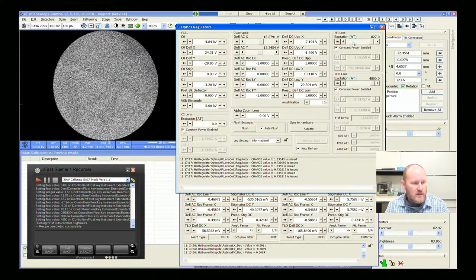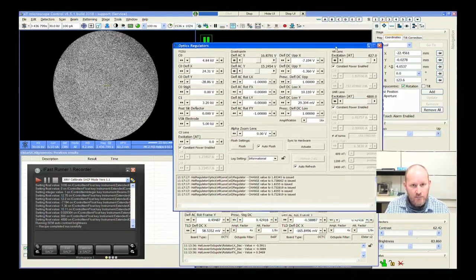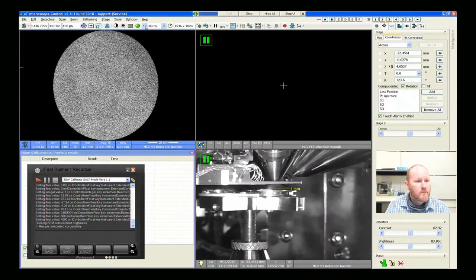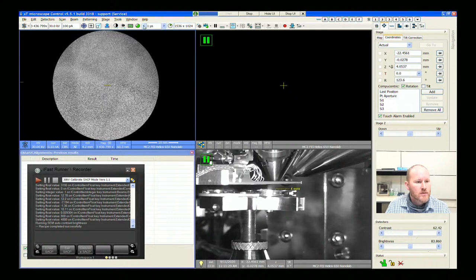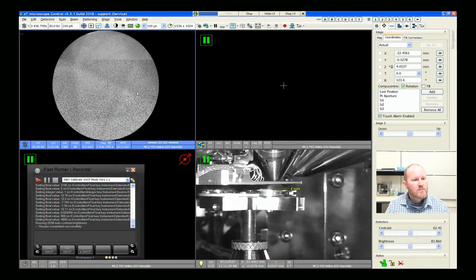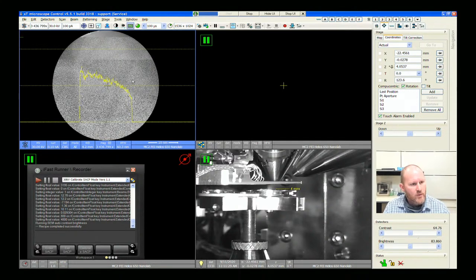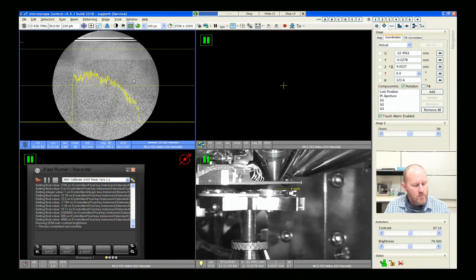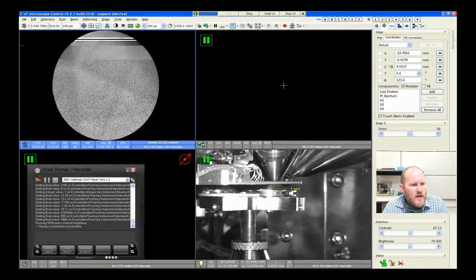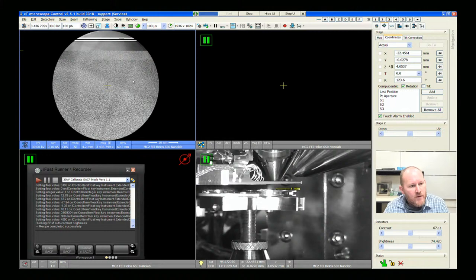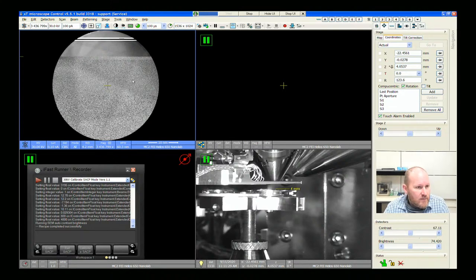This is the same sort of behavior that you see in a TEM when you focus through with your Ronchigram. The channeling patterns are very contingent on the surface being nice and clean — even just a little bit of hydrocarbon can dramatically reduce your ability to make a nice channeling pattern.